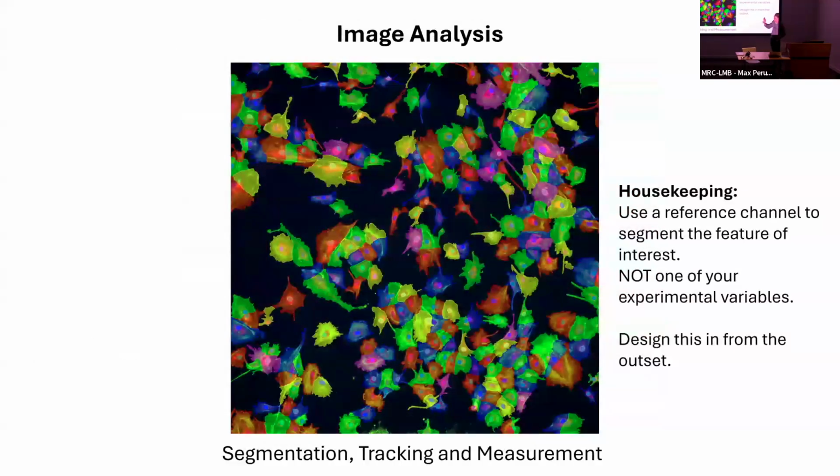Okay, now image analysis. I'm going to do Jerome a great disservice by condensing everything they do into a few slides. But anyway, whatever. You take some images and you've got to try and quantify them. That inevitably ends up segmenting stuff: identify all the things of interest and ask questions. What's the expression level of this protein in the nucleus in this cell?